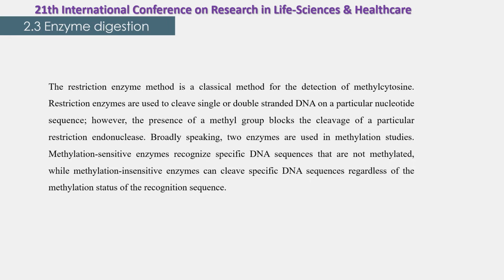The restriction enzyme method is a classical method for the detection of methylcytosine. Restriction enzymes are used to cleave single or double stranded DNA at a particular nucleotide sequence. However, the presence of a methyl group blocks the cleavage of a particular restriction endonuclease.